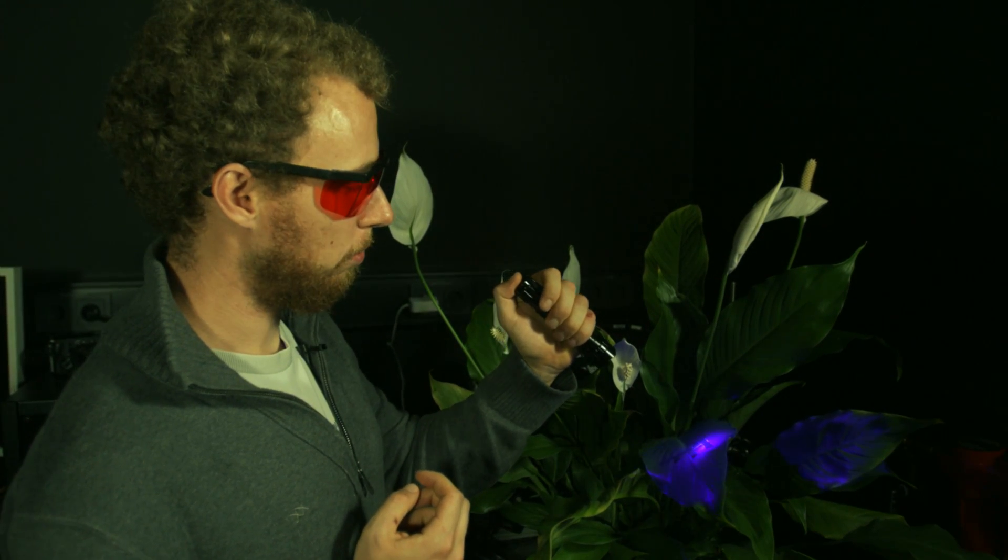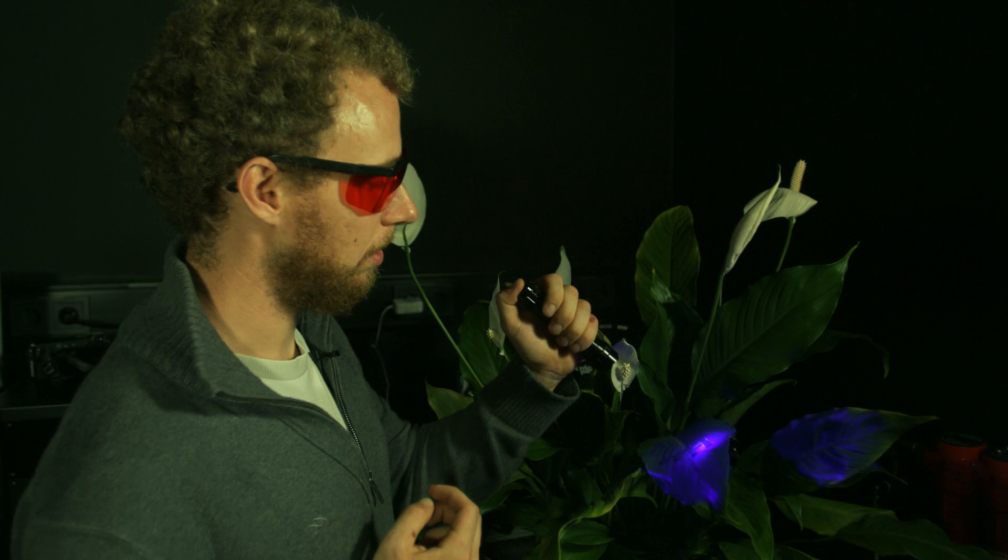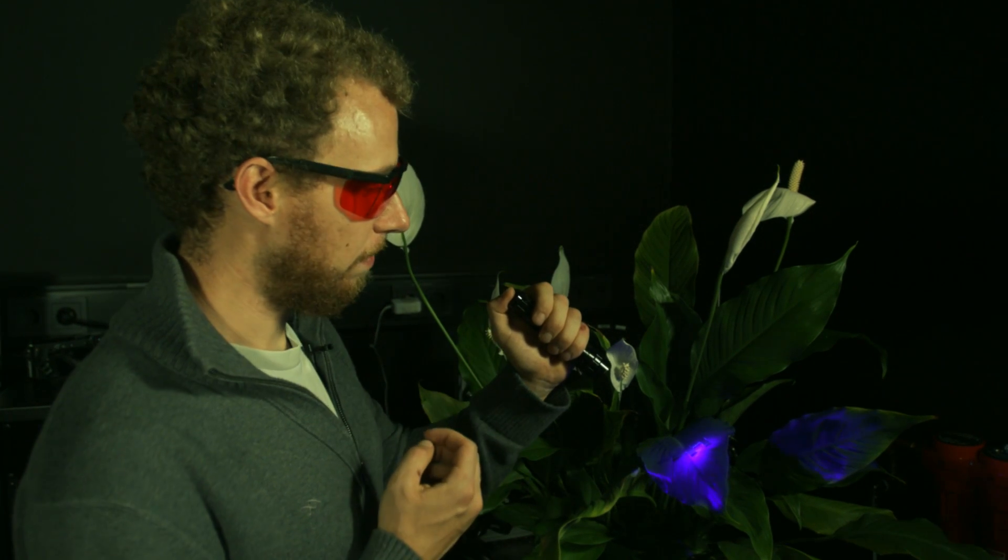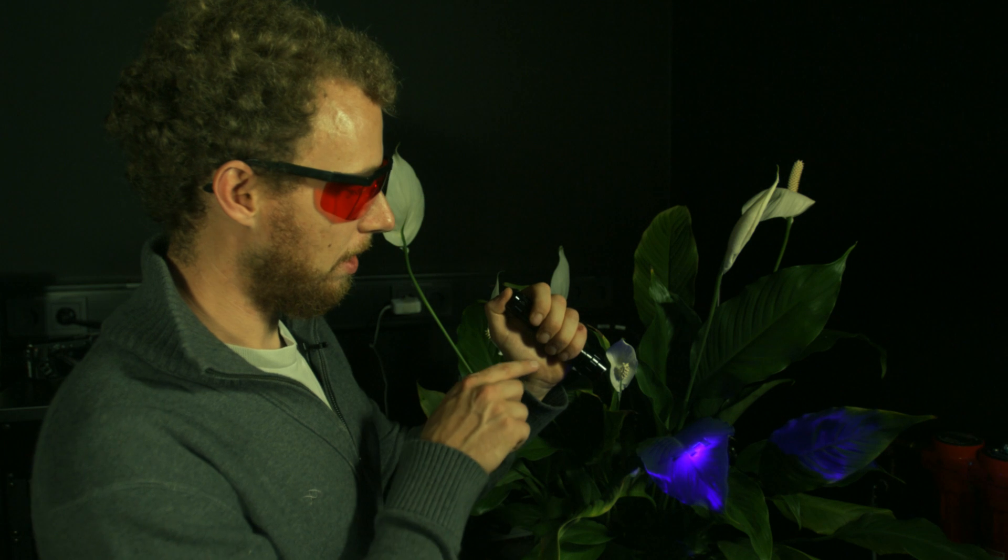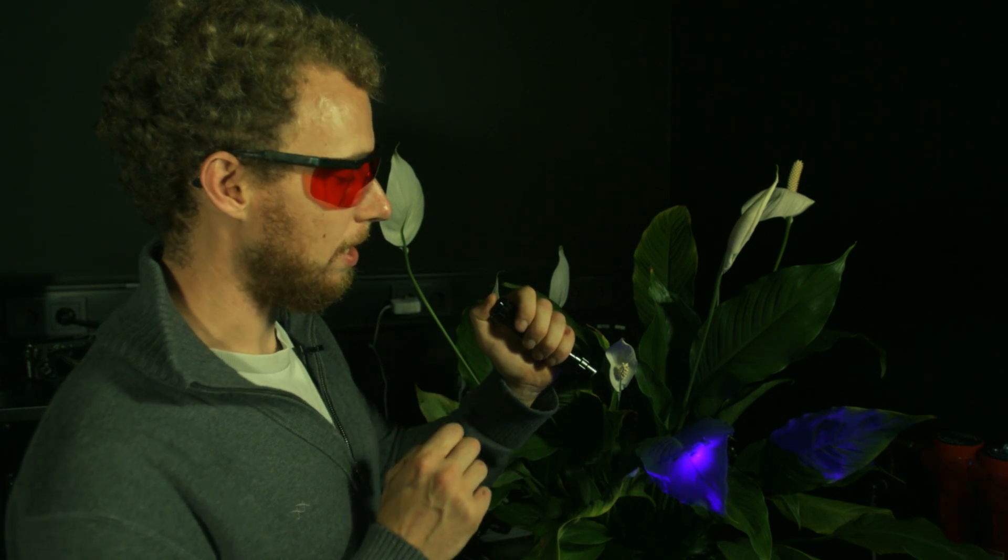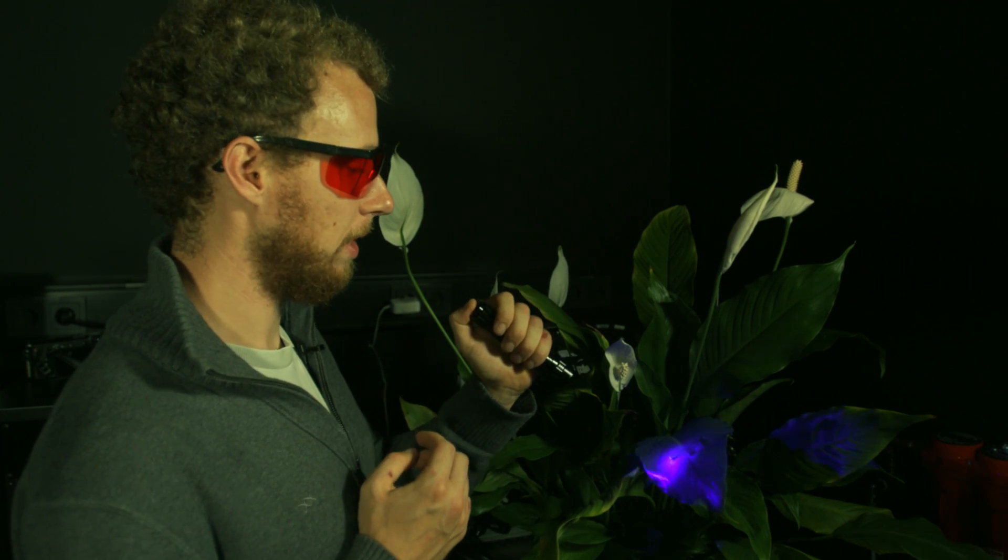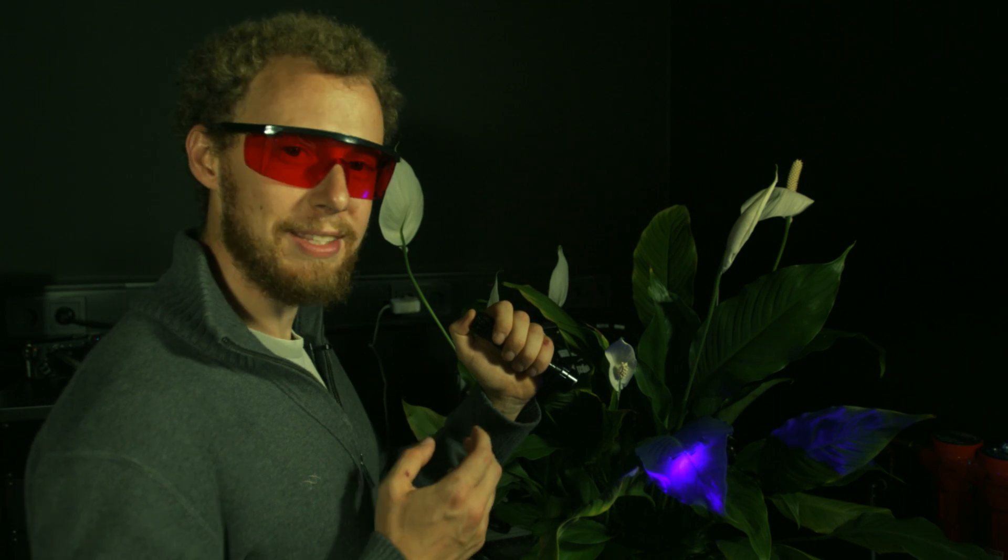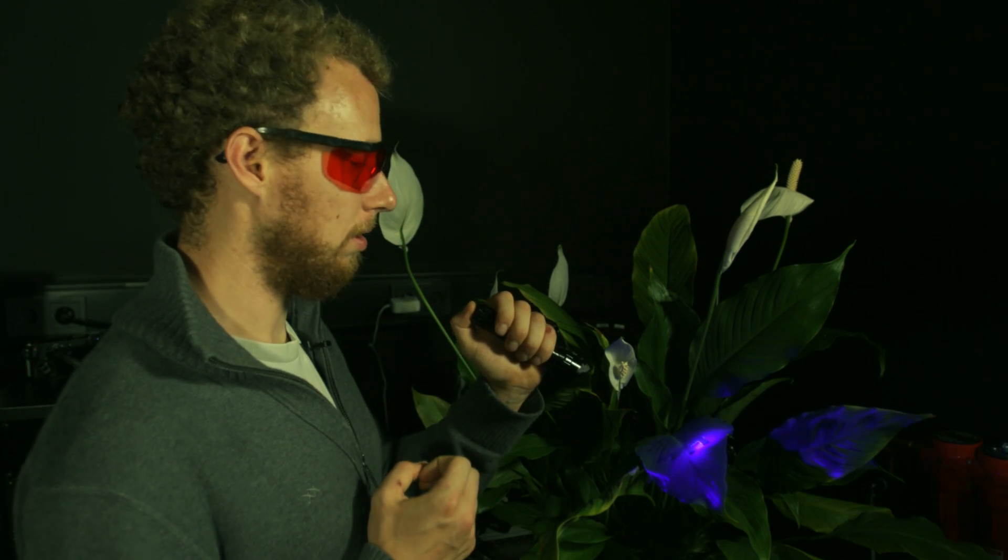The shaded part will remain dark adapted. When we remove the F we will see high fluorescence in the area where the F was and low fluorescence around. This way we can see how plants adapt really fast to different light conditions.